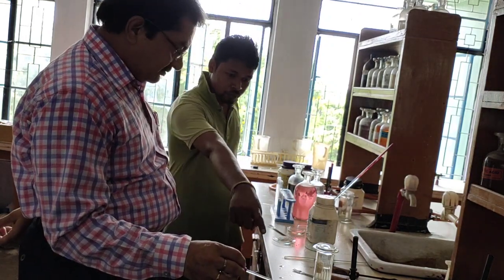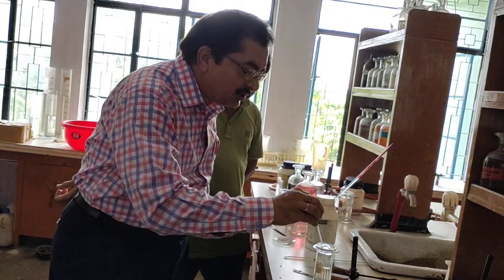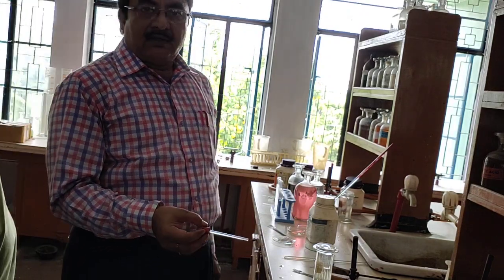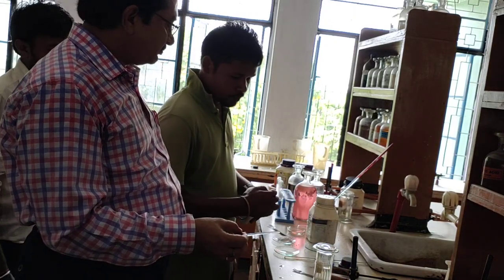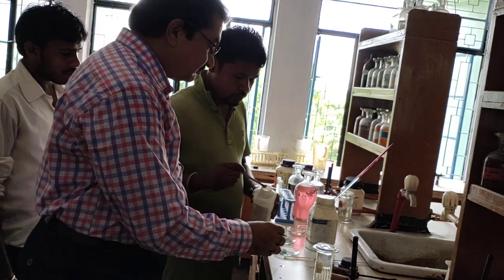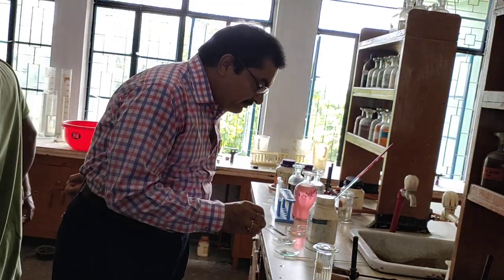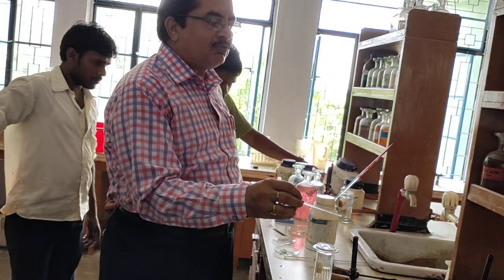This one mixture is there. Pure salt. And this is your pure salt. Then in this one we are putting into this one. Then barium, one by one: barium, calcium, strontium, lead. So one by one we are showing you. See, platinum wire plunging into conc. HCl, placing to the salt, check it here, and then inserting into the Bunsen flame.